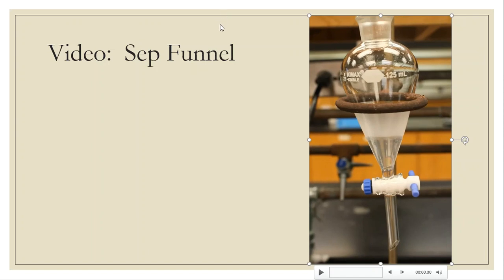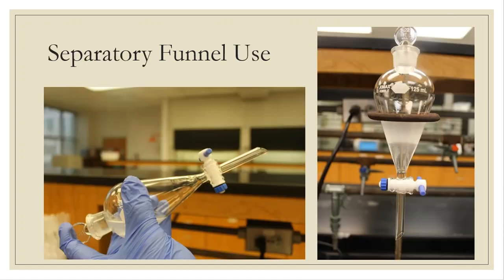Okay, so that gives you an image of what this begins to look like in the separatory funnel. I did wait, and that's normally what I do. I do wait for a good handful of minutes before I begin to drain and extract anything out of separatory funnels. Here's a couple of pictures of how to properly use a separatory funnel.